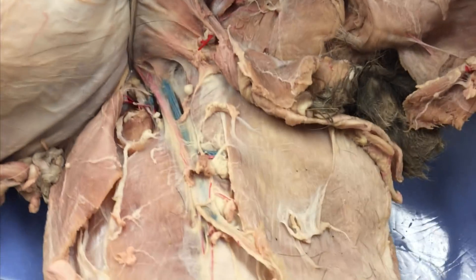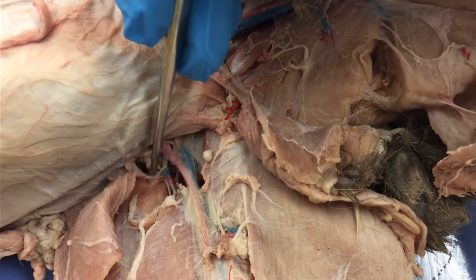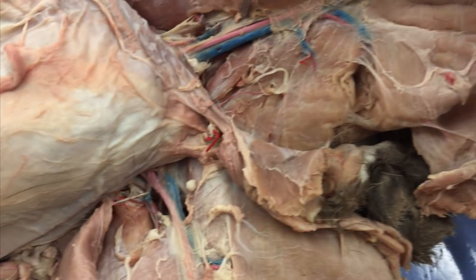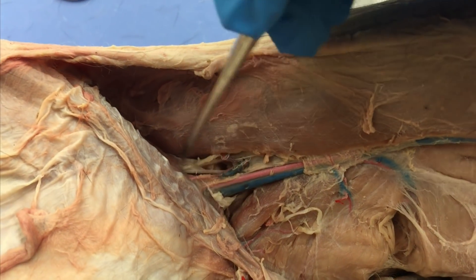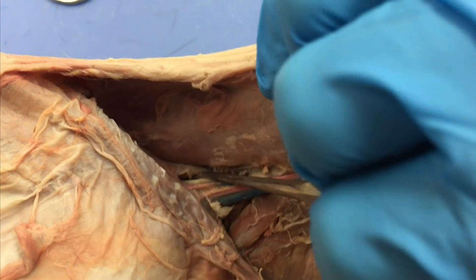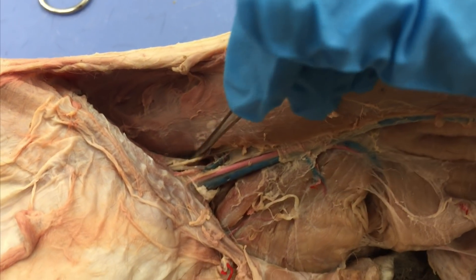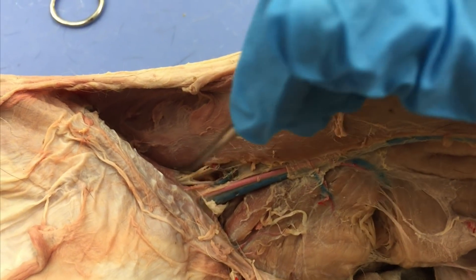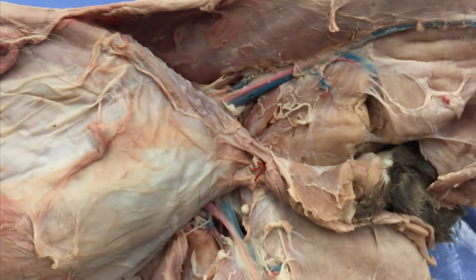Up in here, and it's kind of hard to show, but way deep down there is another smaller muscle. We might actually be able to see it better from this angle — right there underneath this vein. There's a very small muscle here. That's the iliopsoas — that's the one we're looking for, to the lateral side of the femoral vessels.